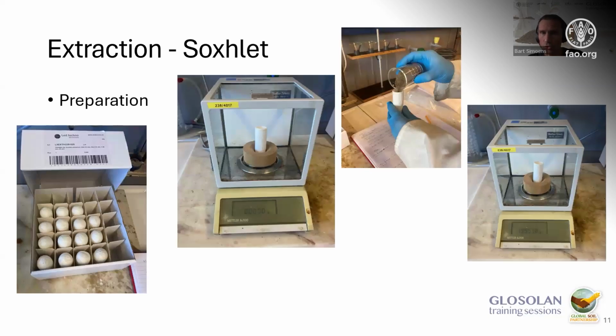We did use the two types of extraction, although the mechanical shaker led to maybe not so good results for RDX. We also had to look for TNT and DNT. And in all honesty, the mechanical shaker is a lot easier to use than the Soxhlet apparatus. First of all, we can put a lot more samples on the shaker. We can only do 6 Soxhlets simultaneously. So we did both extractions for all the samples.